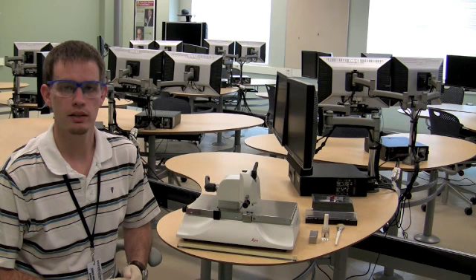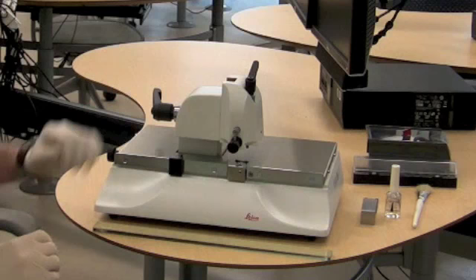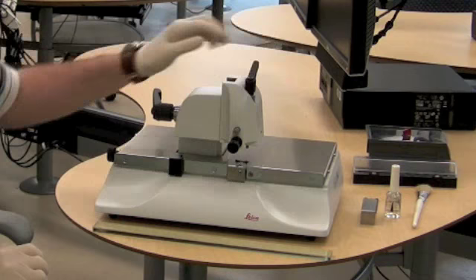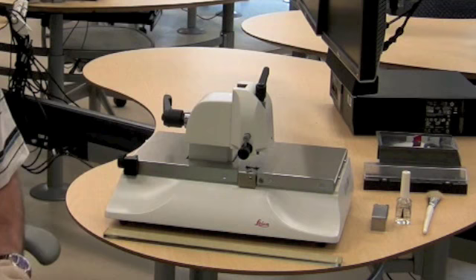Now we're ready to make glass knives. We have our 400 millimeter piece of glass, and the first thing we're going to do is check four things on the instrument. We're going to make sure that the clamping lever is facing the back of the machine. We're going to make sure the breaking lever is facing the back of the machine. We'll make sure that our scoring shaft is all the way back into the machine. And we're also going to make sure that our movable stop is in its first position, all the way to the left side of the instrument.